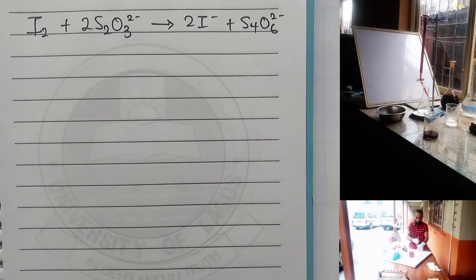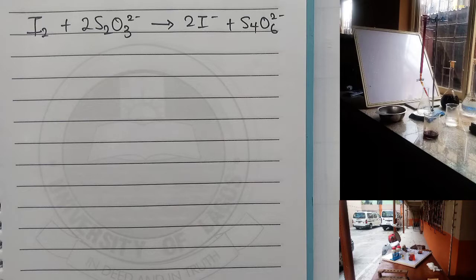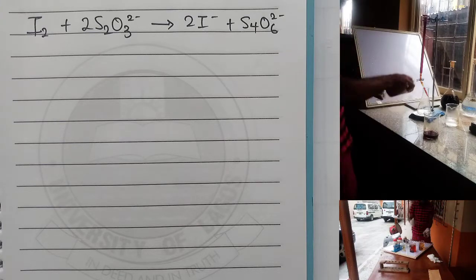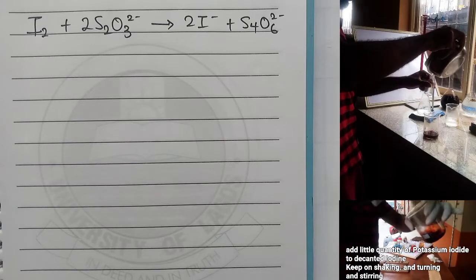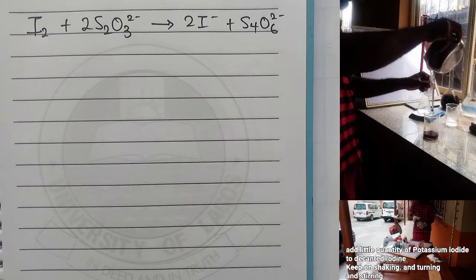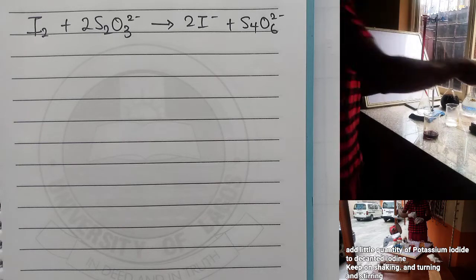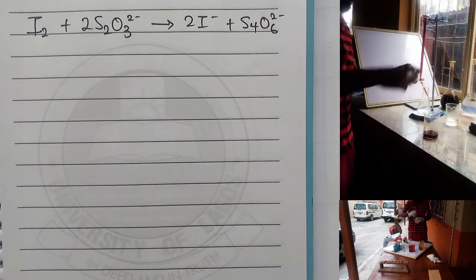If I had followed the normal way other teachers have followed, my reading would have been towards 60 something, 50 something, 70 something. Some people might even get 100 plus. I want you to get that. As you can see on the screen, I am trying to explain what I did in that video that led me to my value. And there is a justification for you as a teacher not to get perfectly what you are expecting.